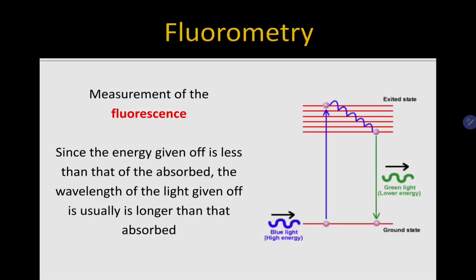Okay, so remember that fluorometry is the measurement of fluorescence. Since the energy given off is less than that of absorbed, the wavelength of light given off is usually longer than that absorbed.